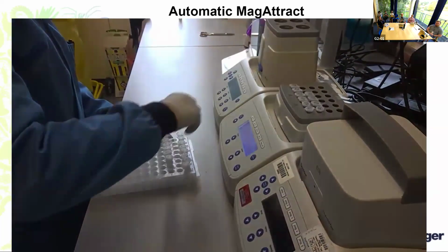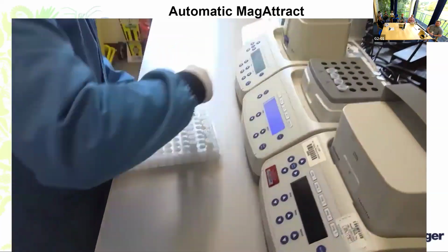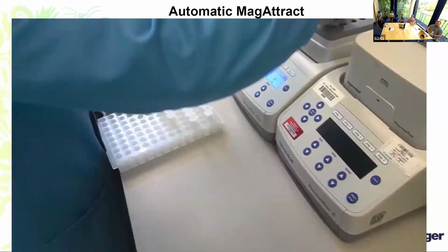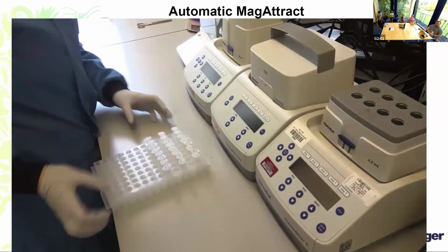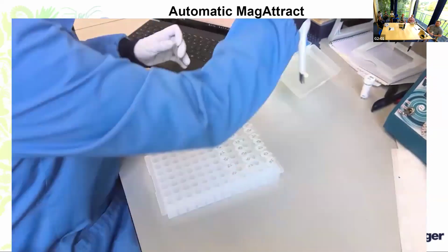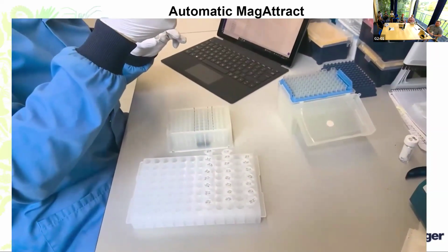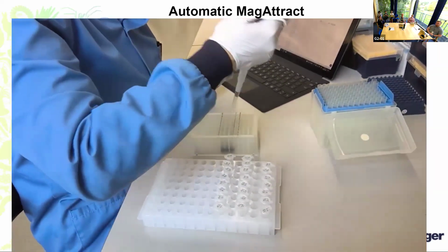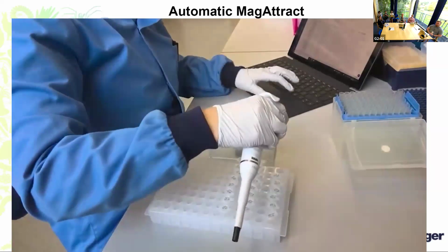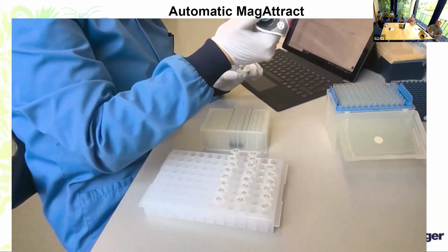So after our lysis step, we remove our samples from the heat block. Again, quickly centrifuge the samples down to accumulate any lysis buffer that's accumulated on the side, and then we transfer samples into the sample plate. So this has, as I mentioned, 40 microliters of magnetic beads and a binding buffer, which helps the DNA bind to the magnetic beads.